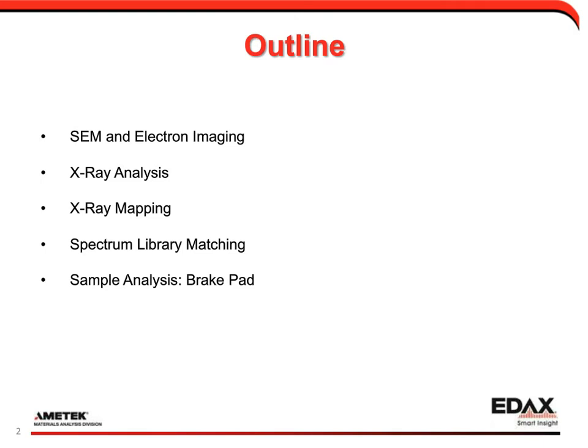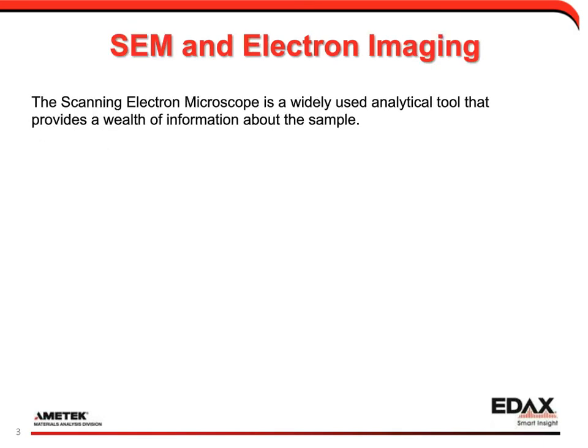So with that said, SEM and electron imaging. Most of you will probably be users, or at least have knowledge, of scanning electron microscopes, or SEMs, and they are becoming quite prevalent tools at this point. It's no longer just academia and imaging tools.